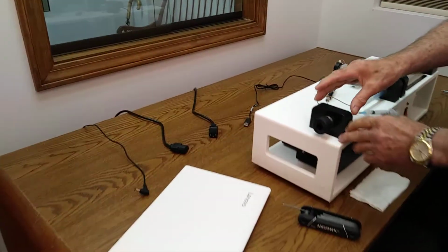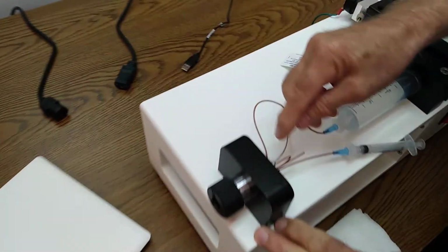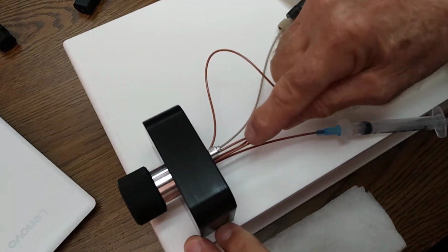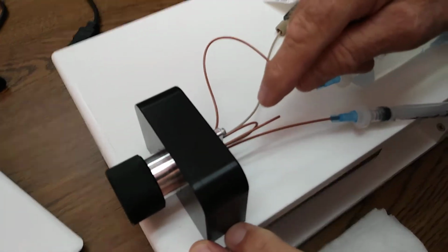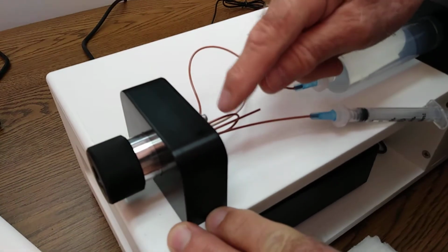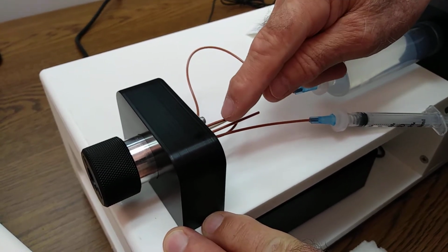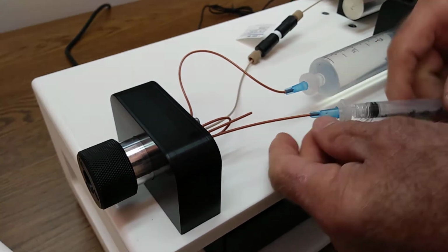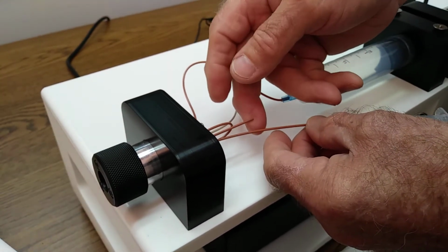So the next thing in the system is the injector. It is a 6-port valve loop injector. This little round thing protruding out is what holds the sample and measures the volume. This is a 10 microliter injector. This, as I've already indicated, is where the sample is pushed in, and this is the vent.